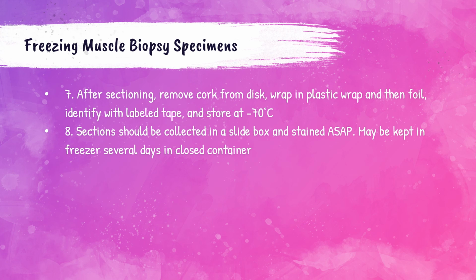area. Sections should be collected in a slide box and stained as soon as possible. They can be kept in the freezer for several days if they are kept in a closed container. There may be a slight reduction in some enzyme activity when stored, but if stored properly, not too much.